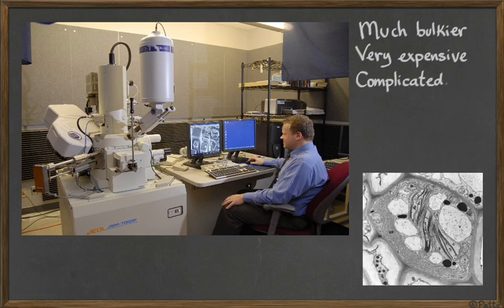They are also kind of complicated to use. Usually in the universities or other research centers, there is a technician whose job is entirely to prepare and make the images that are asked for by the researchers and the doctors and so on. So you need a technician just to operate the microscope. While the optical microscope, you put on top of your desk and you can use it yourself. Very easy. You are going to use optical microscopes in our classes here.